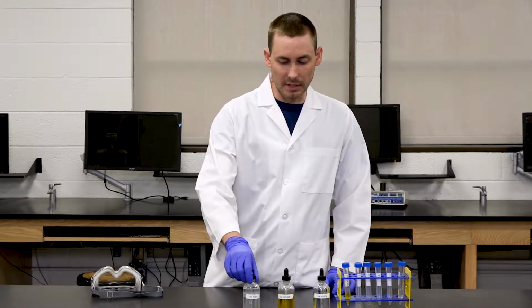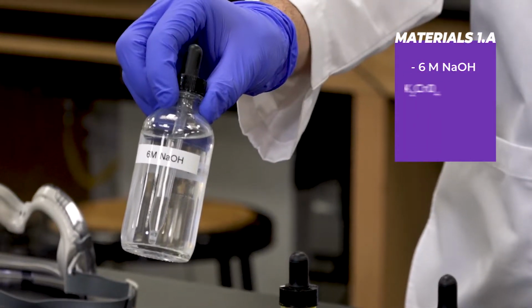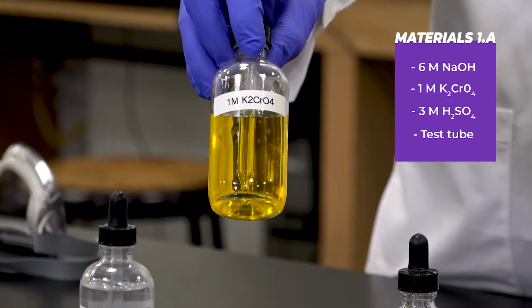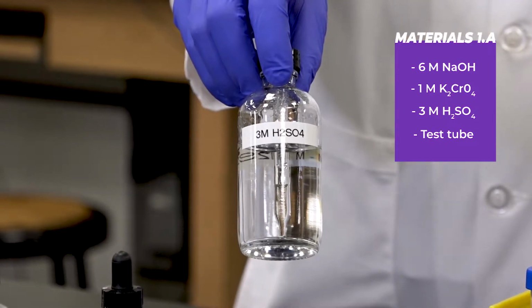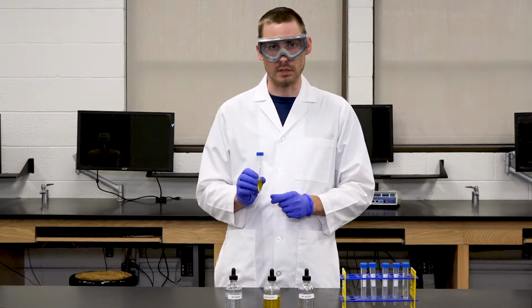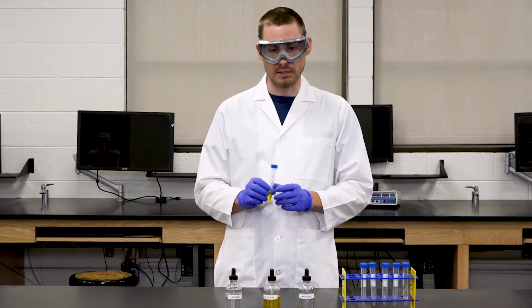So today we'll be performing 3 experiments from your lab book. Experiment 1A, Experiment 2A, and Experiment 3A. For Experiment 1A, we'll be talking about the common ion effect using the chromate ion. For this experiment, you'll need 6 molar sodium hydroxide, 1 molar potassium chromate, and 3 molar sulfuric acid, and 1 test tube. This is a test tube that contains 3 milliliters of 1 molar potassium chromate.